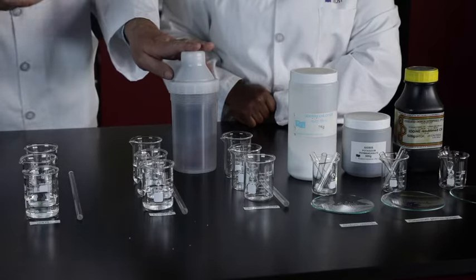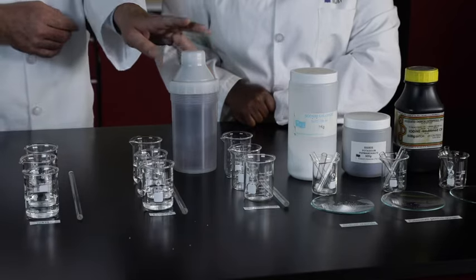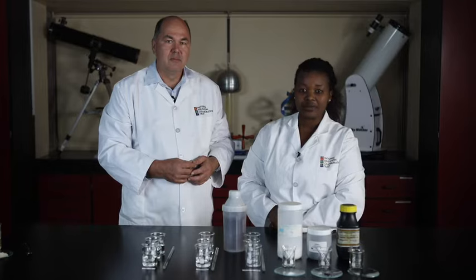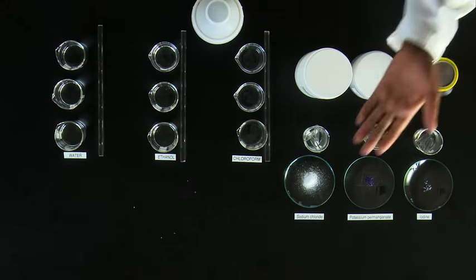Chloroform is a very toxic and volatile substance. Now, we add the same quantity of solute to each of these beakers. We will try sodium chloride first.